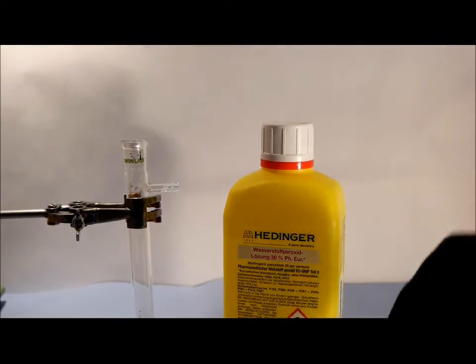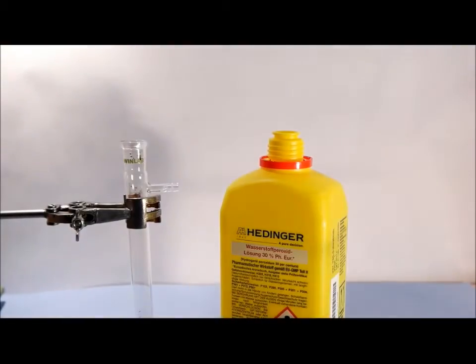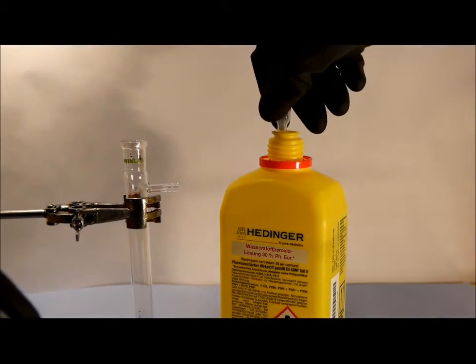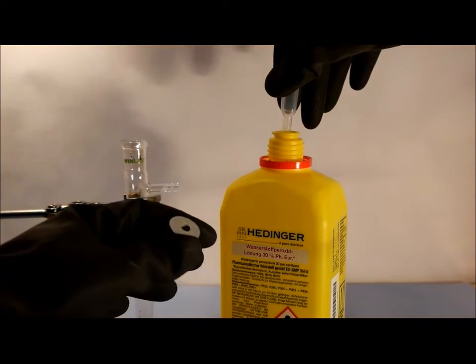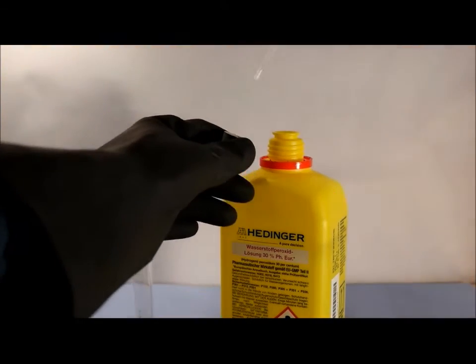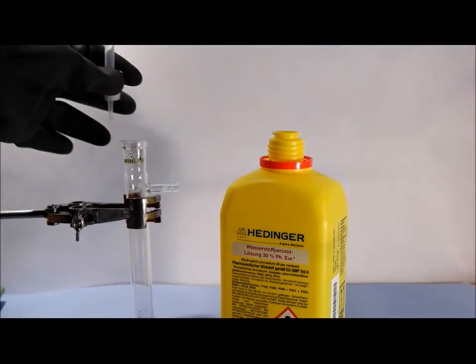Now take some drops of the hydrogen peroxide in a pipette and then stick it in a stopper like this one. Now you can put it on your test tube.